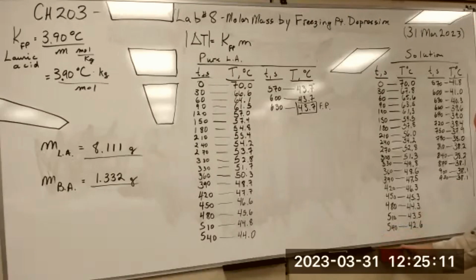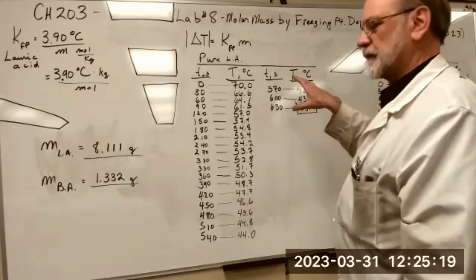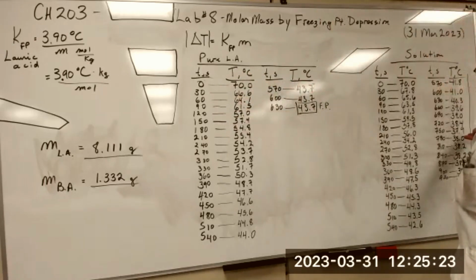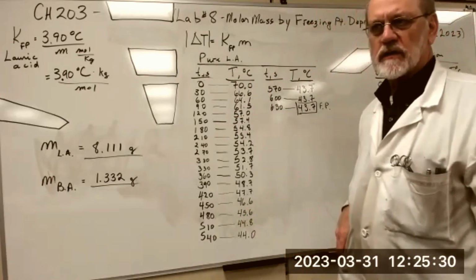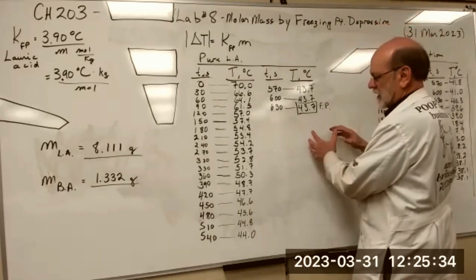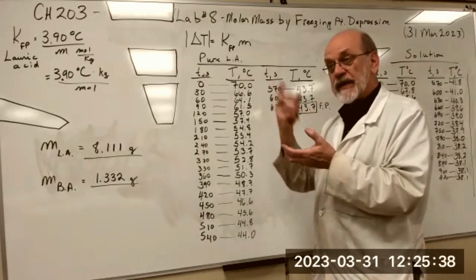Sometimes you see in a liquid that's freezing... Oh yeah, I see it now. It's moving. Yeah, that's kind of cool. This temperature change here, it went 38 and then up to 38.2. Sometimes what you'll see is what's called the latent heat of fusion. So when you go from a liquid down to a solid, the molecules are slowing down and they're giving up heat.